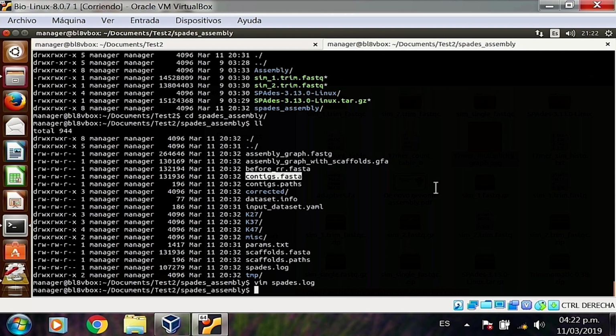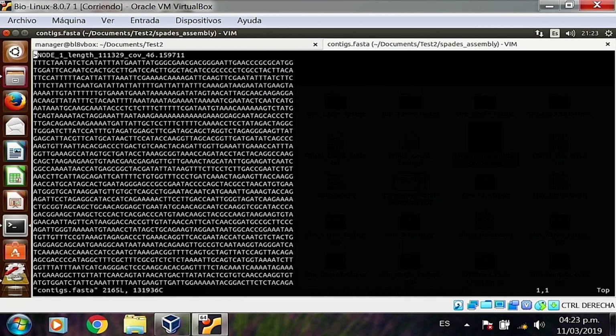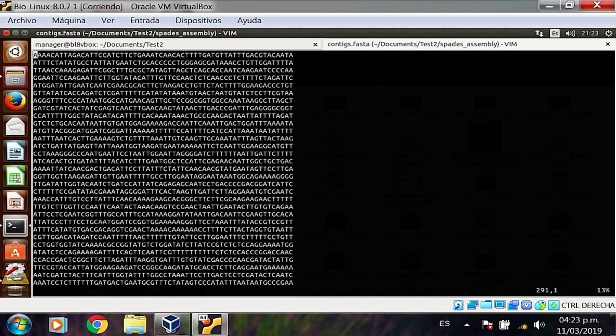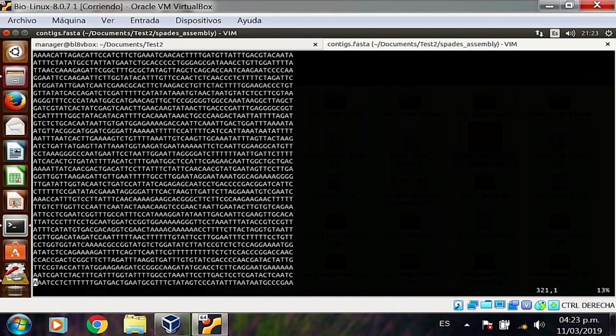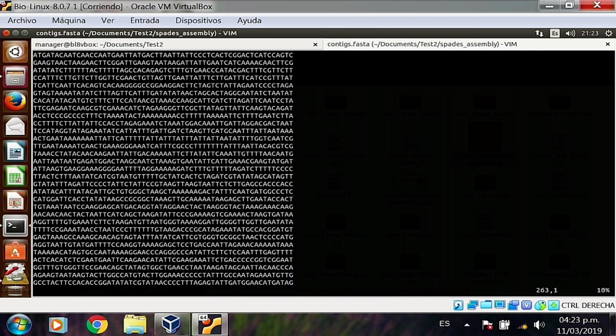The file is small enough that we can vim it, and we can explore a little bit what it looks like. It looks okay, I guess. It's just a sequence. There's nothing we can really do with this at this point. We're just taking a look at it, and we're trying to find a way, how can we take a look at this file and get some meaning out of it?